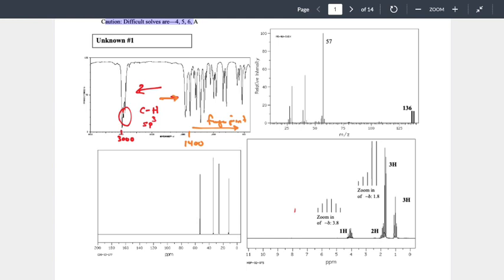Well, the fingerprint is now so nuanced and challenging to look at that it's usually not worth the trouble. It's not that it's not important, it's that there's a ton of information there, and that's effectively information overload. That's why we ignore it. And we shouldn't just blanket ignore it, because there is useful information in it, but we should really only dig into it if we have to. There has to be a reason to move into it. That's our fingerprint.